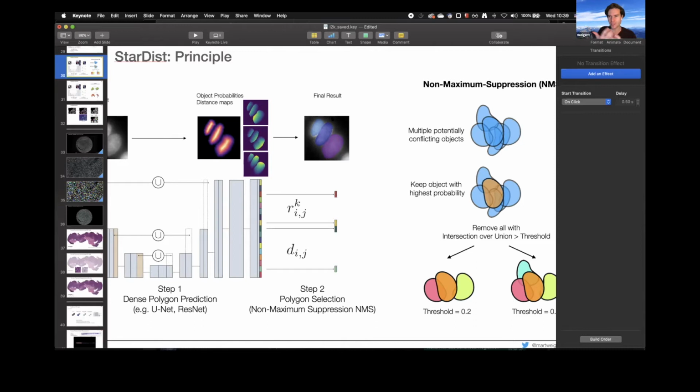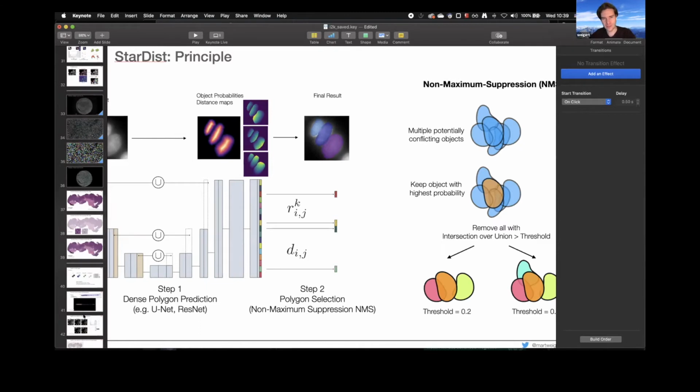And for the watershed growing, you can use what I will speak about now, which is a probability map that is only foreground and background. Because in crowded cell environments, the hardest part is always to get the seeds correct, not miss seeds and not get falsely merged seeds. But the growing is typically an easier part than finding correct seeds.